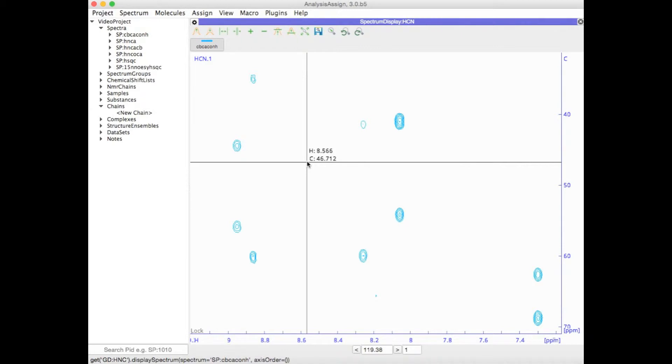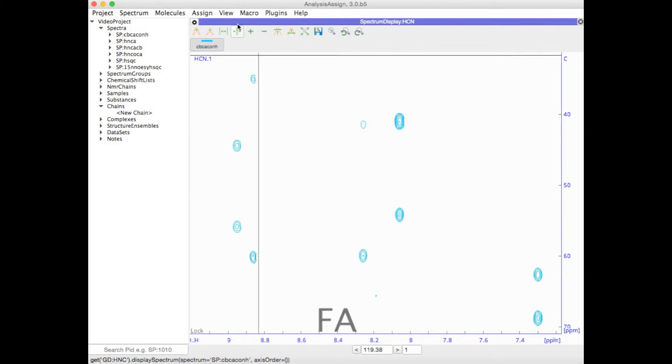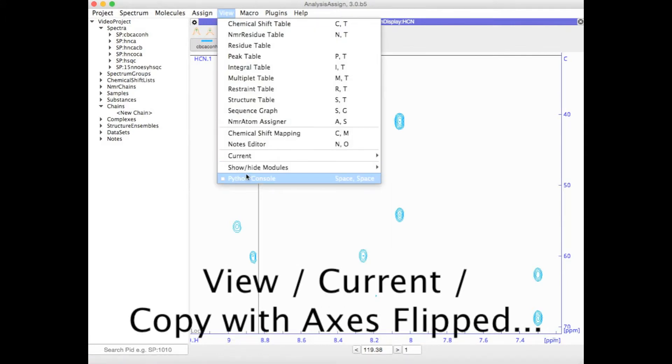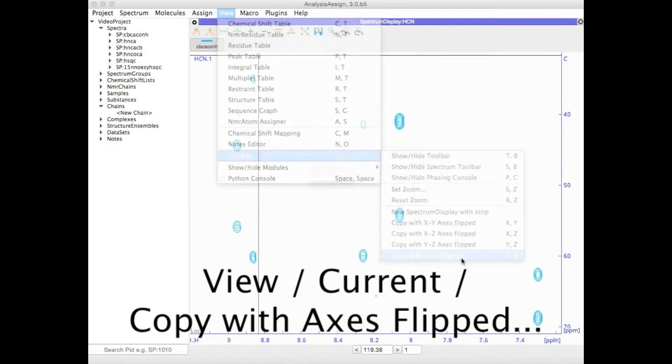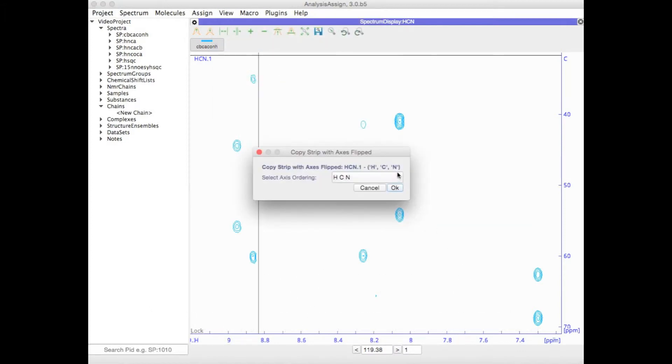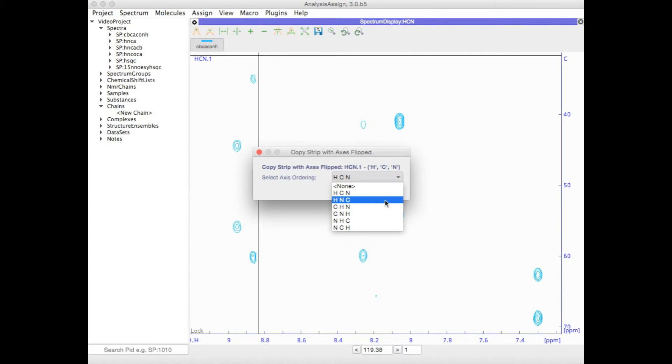An alternative way to change the axis ordering is to type FA for Flip Axes, or go to View, Current, and then Copy with Axes Flipped. This will bring up a small pop-up where you can select from the drop-down menu the axis ordering you'd like to have.